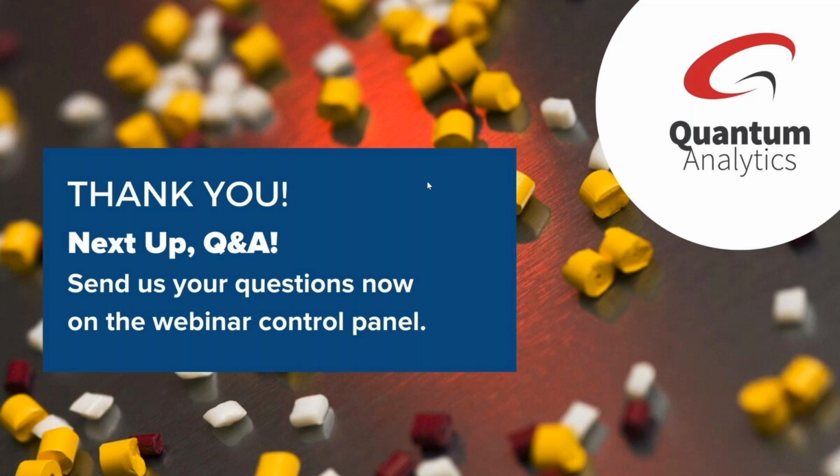Awesome. And I actually do have another question that snuck in here. What kind of sensitivity can I expect for measuring alkanes or amorphous carbon? Can we see monolayers or a few layers on a surface? So it depends on whether you're doing that by IR or by Raman. If you're looking at hydrocarbons on surfaces, you can do monolayers and even submonolayers, and you can do them macroscopically or microscopically with the Hyperion microscope. We have a patented grazing angle objective for doing monolayer detection.